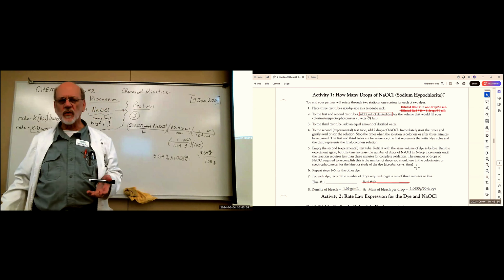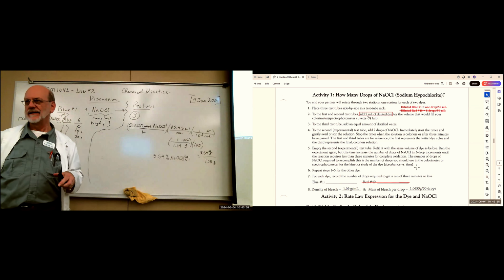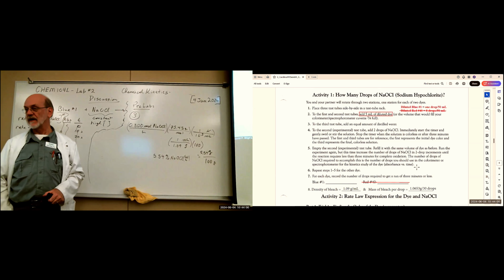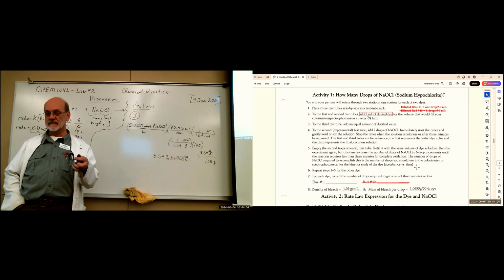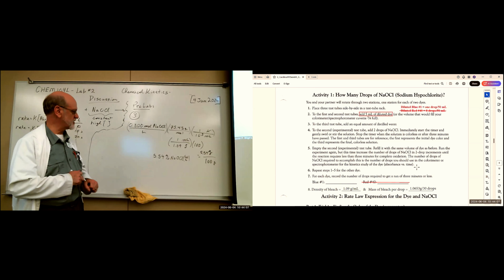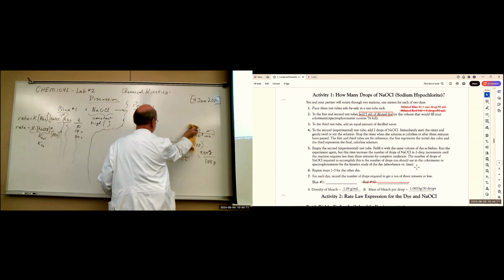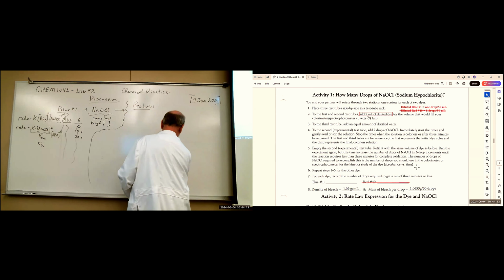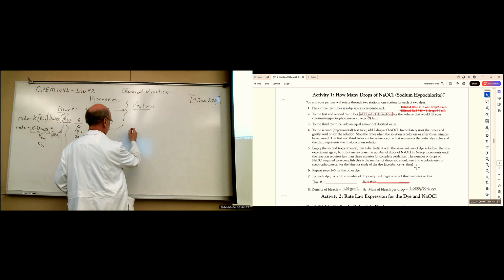Now, why do we use absorbance instead of knowing the concentration of blue dye? Convenience. Absorbance is a linear response to concentration. That's Beer's law. I think I've got a section on Beer's law in the post lab questions. It's the first one. It says the data in this experiment obeys the Beer-Lambert law, explain this law.